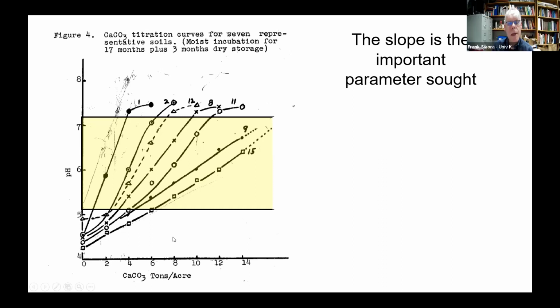Yeah, if they're really strongly acid, maybe they're still linear down here. You see some of these soils have linearity. I don't know. I guess you'd have to look at them individually to see what the response looks like in this region below 5.2 compared to above 5.2.